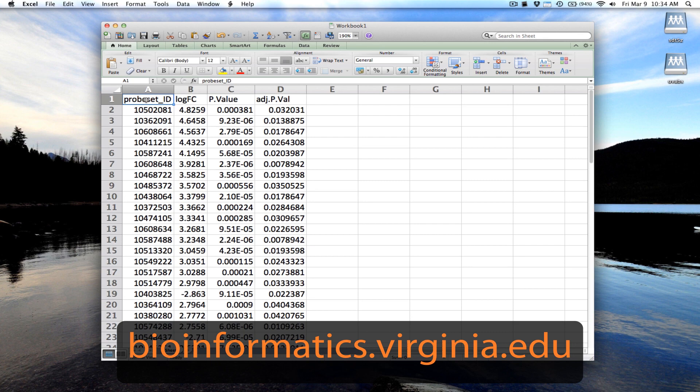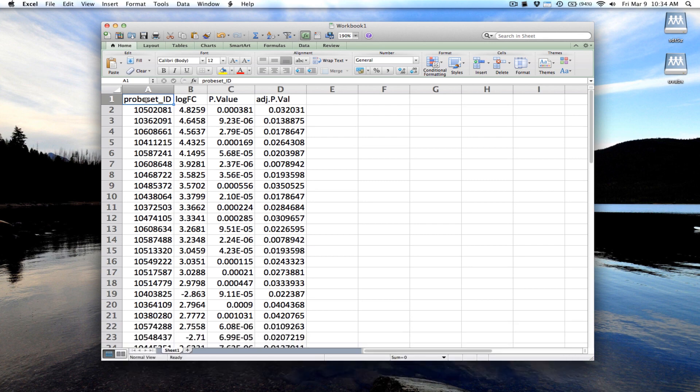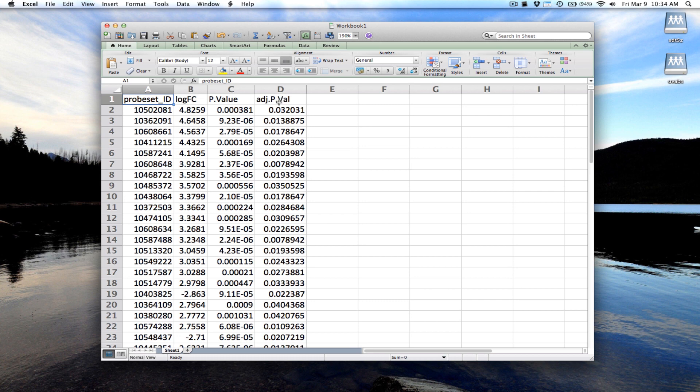In this example, we've run a microarray experiment on the Affymetrix mouse gene 1.0 ST array. We have a probe set ID, a fold change, a p-value, and an adjusted p-value.